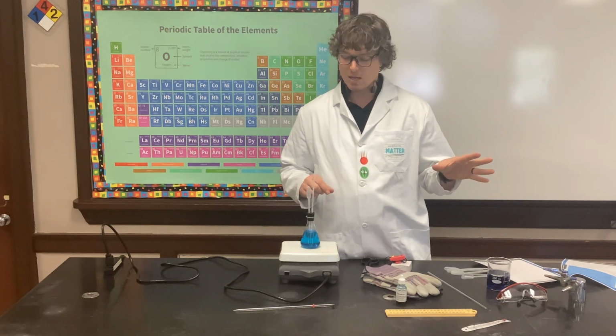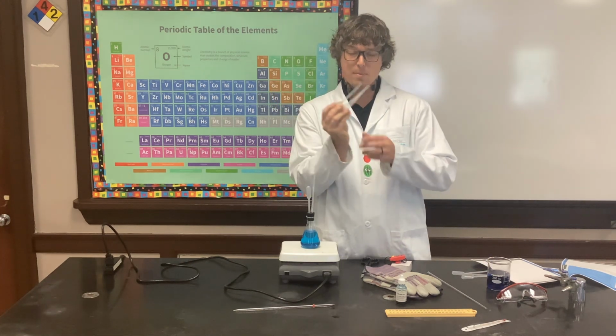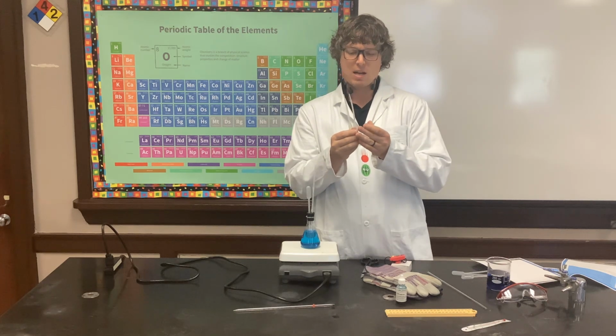So I got a pro tip for you for a better solution than using the glass rod, which is in your materials kit. What I did is I just took some of these pipettes. There's millions of pipettes around the district. Hopefully you have some, if not I can get you some.